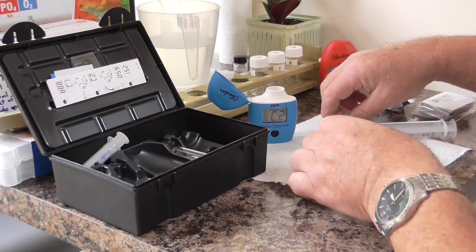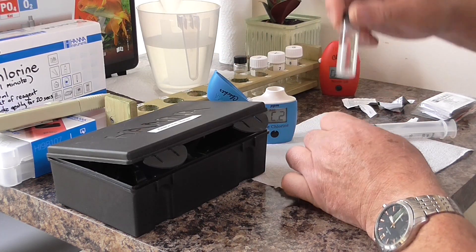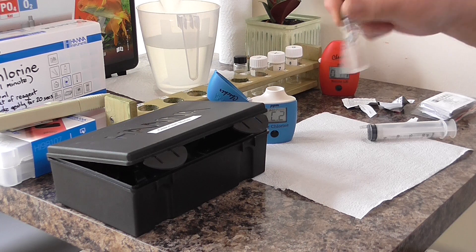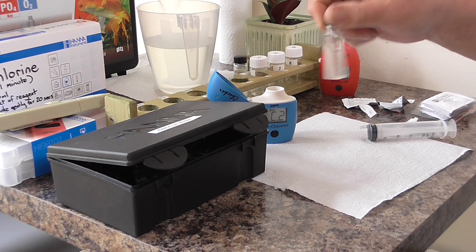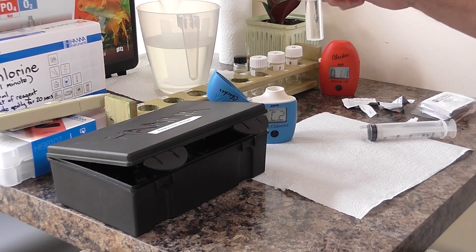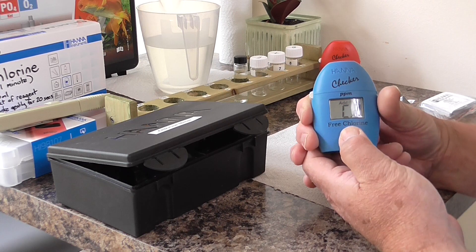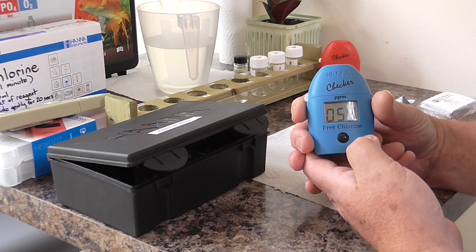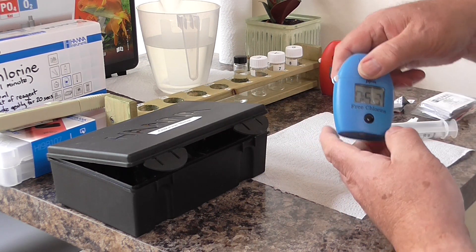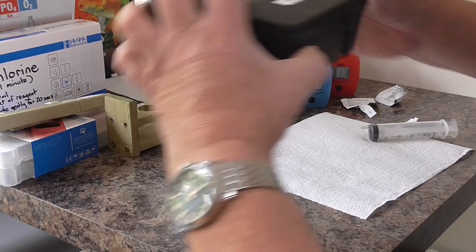Put the tube in, put the top on, shake gently. Get that in the meter, shut down, press and hold — this is going to take one minute to check chlorine levels. Put that one aside, reagents back in. Next test is ammonia.